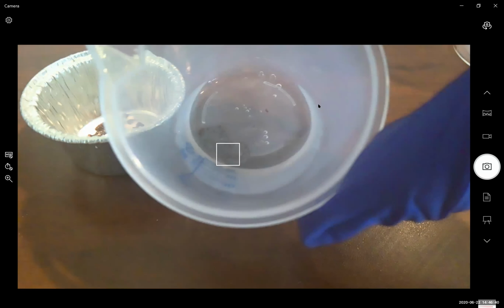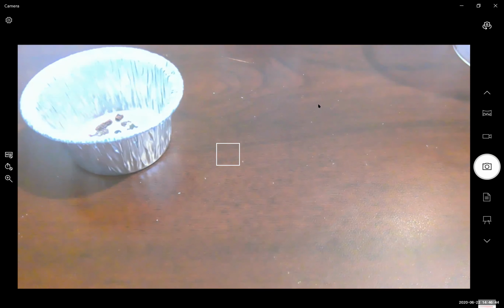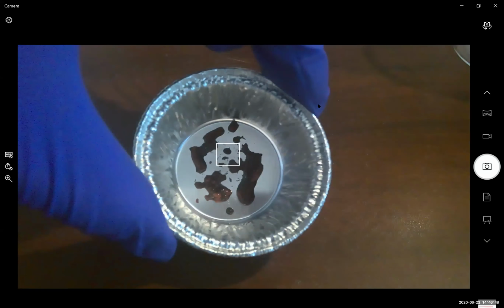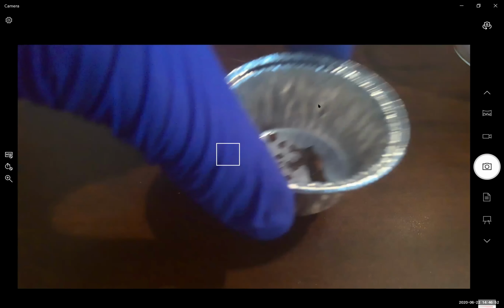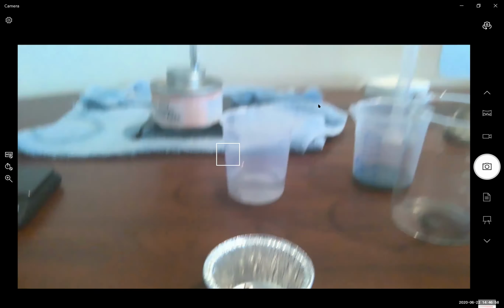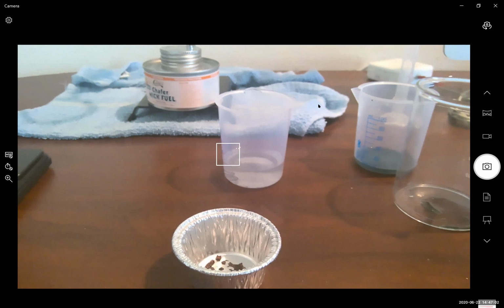Notice how they're much more silvery now. And now we have what is supposedly leftover copper in our aluminum container. Now, all we have to do is dry our copper as thoroughly as possible. And to do this, we're going to put it in the oven.